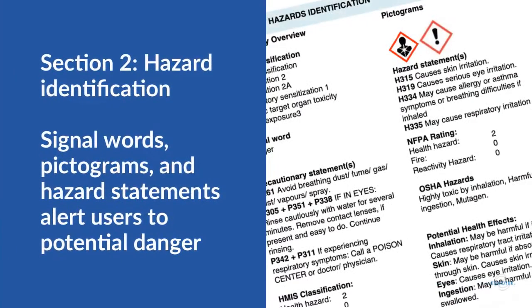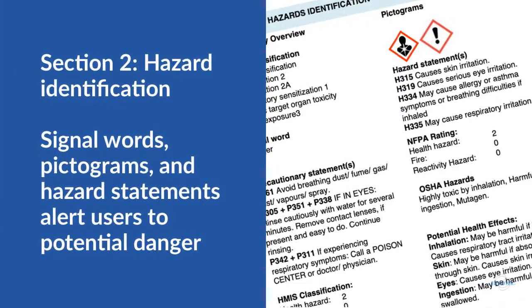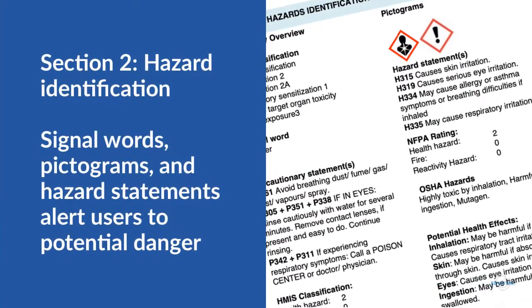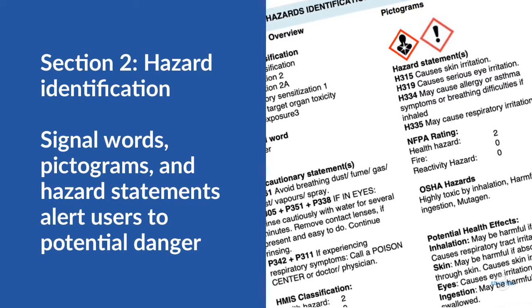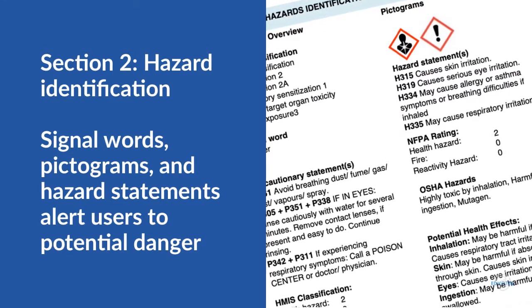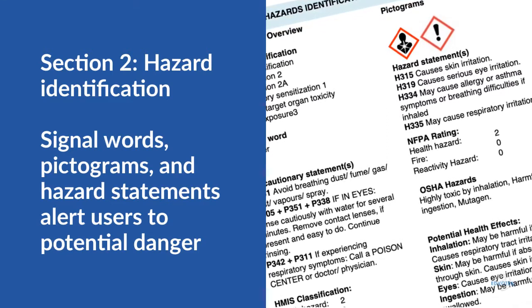There is important information in Section 2. This part highlights all hazards regarding the chemical, including signal words, pictograms, and hazard statements.